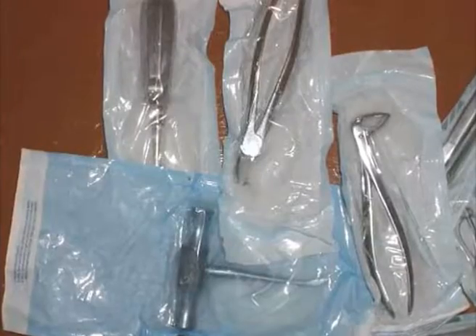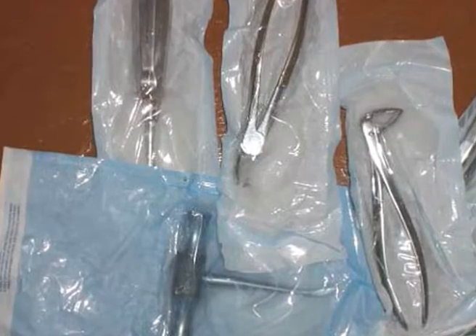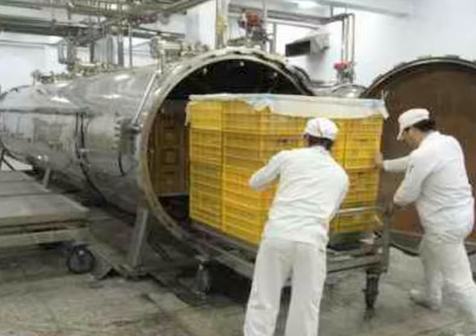Okay. The things that can be sterilized in autoclaving are mostly used in hospitals and laboratories. It is used for the sterilization of the growth media for the microbes. It is used for the sterilization of surgical instruments. It is used for sterilizing various glasswares. It can be used for sterilizing blankets, operation theatre used labwares, and many more things. The application of the autoclave is really endless.